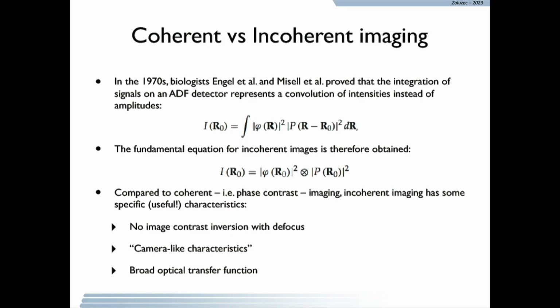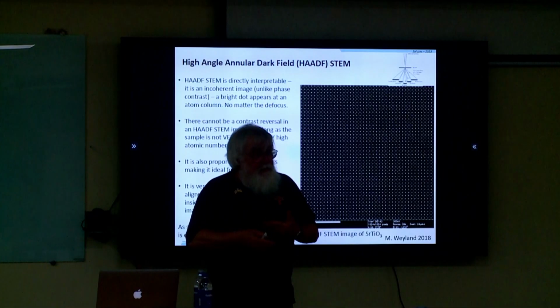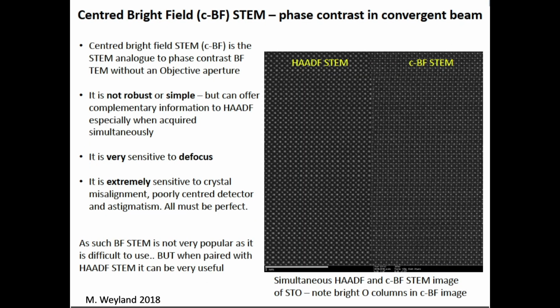Let's go forward. I don't want to talk about this today. With this high angle scattering, remember I told you the nice thing about it is we can form very small probes. We have atomic number contrast, and over this entire field of view, the focus isn't changing, the contrast isn't changing due to sample thickness. Atoms are always the same color because it's Rutherford scattering, not phase contrast scattering. Just examples of this, so we're going to skip forward.